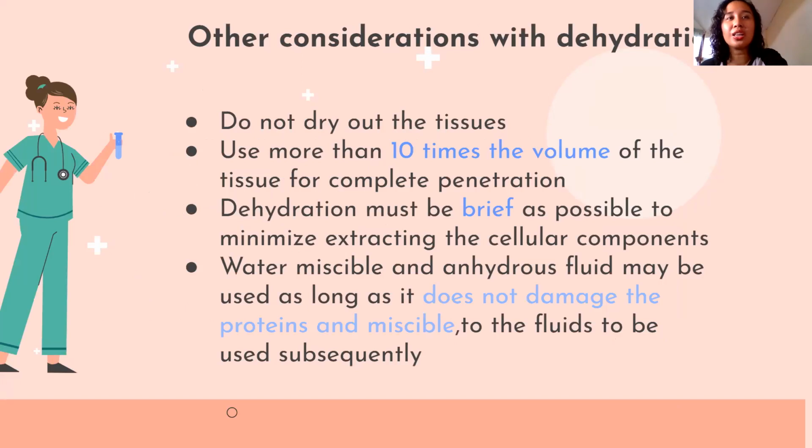Yeah. So other considerations we have to take note about dehydrating agents is it should not dry out the tissues. So dehydrating is different from drying. Okay, so it should not dry out your tissues. And so sa fixatives, the minimum volume of fixatives should be more than 20 times.